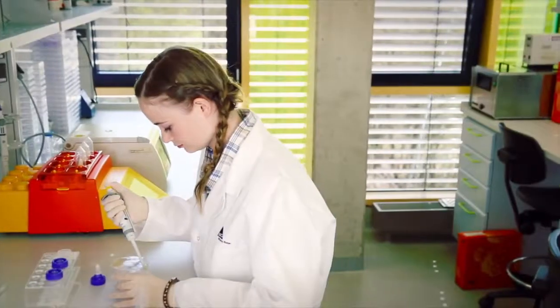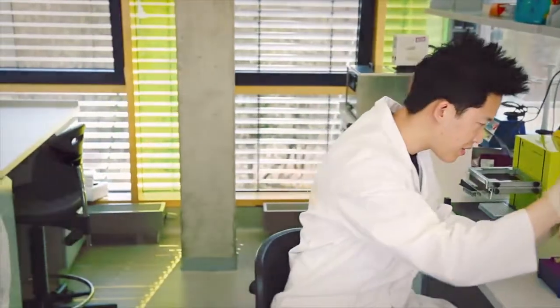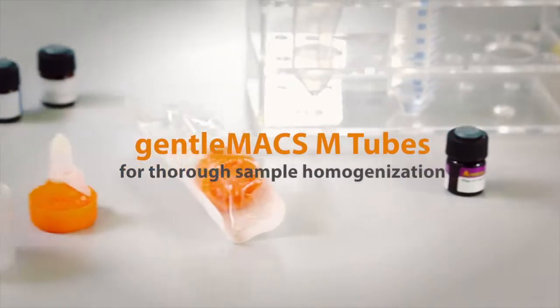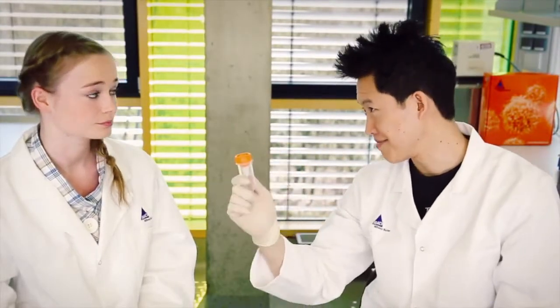She uses gentleMACS C Tubes to get viable single-cell suspensions. He uses gentleMACS M Tubes to achieve thorough sample homogenization. The C-tubes are great for cell separation, cell culture, and cell analysis experiments. But the M-tubes are even better for molecular or microbiology analysis.